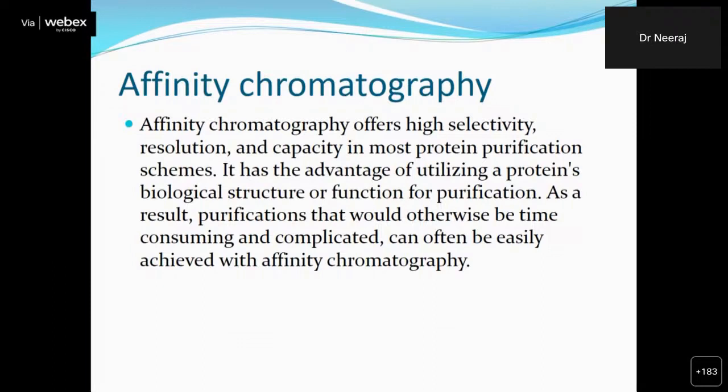It has the advantage of utilizing a protein's biological structure or function for purification. As a result, purification that would otherwise be time consuming and complicated can often be achieved easily with affinity chromatography. Because of affinity, you must know there are specific enzymes for antigens, antibodies, amino acids and biological structures, which have affinity for specific substances, so we can utilize this.